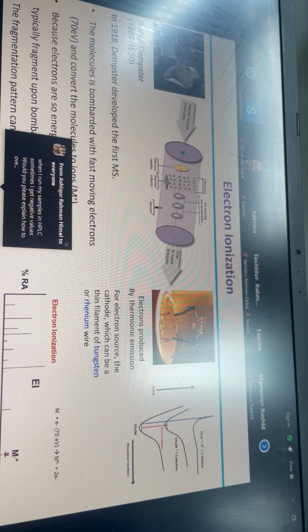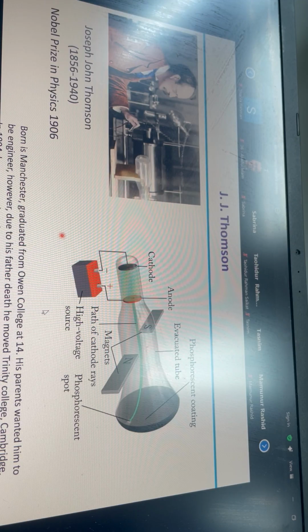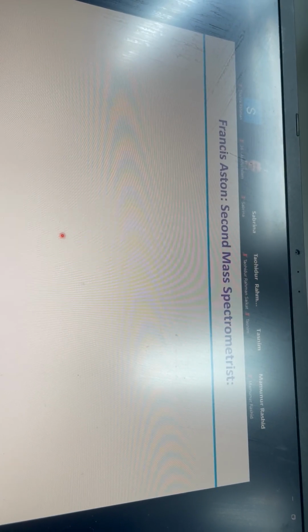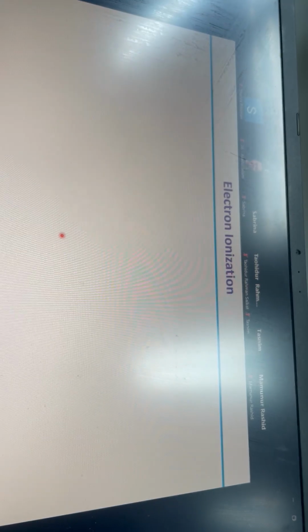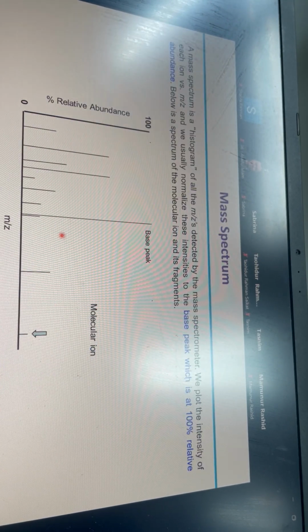Yes, sir. So I started from J.J. Thomson, and I tried to tell a story about how mass spectrometry evolved. You cannot know everything from this lecture, but you will have a broader view.